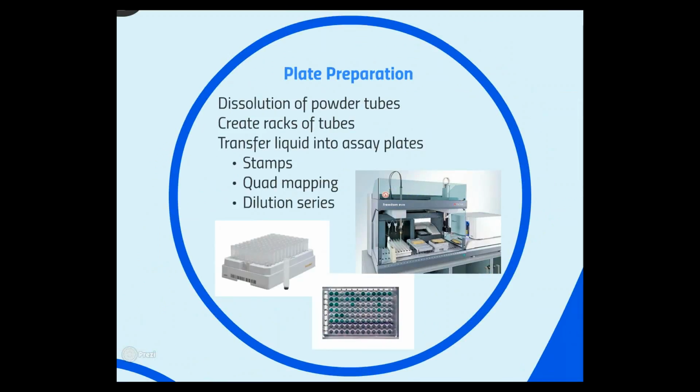And of course, once we have the right source materials available in compound management, we also support the process of plate preparation. So this includes dissolution of powder samples into liquid tubes and placing the liquid storage devices, and then creation of racks of tubes that can then be transferred into assay plates, including stamp operations, quad mappings, dilution series, etc., and control of controls and standards as well. And of course, we'll need support for some automation of some of those processes, such as driving liquid robots, etc.